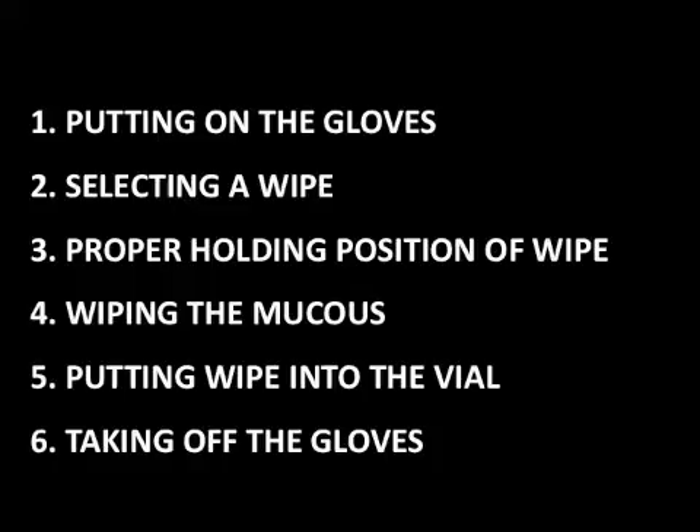Today we are going to show you the steps of: 1) putting on the gloves, 2) selecting a wipe, 3) the proper holding position of a wipe, 4) wiping the mucus from the pig's snout, 5) putting the wipe into the vial, and 6) taking off the gloves.